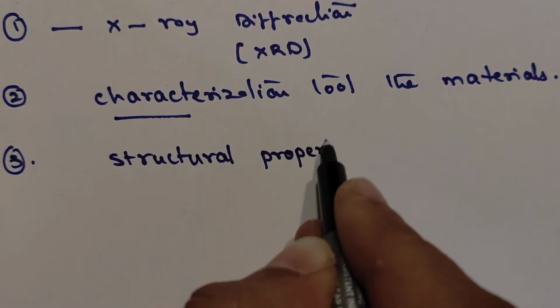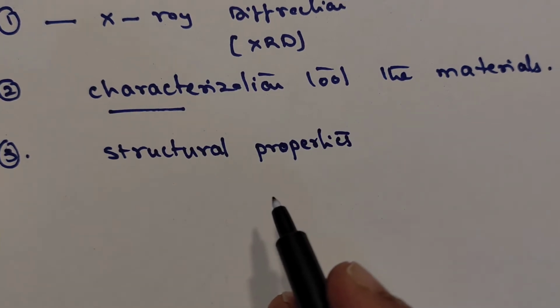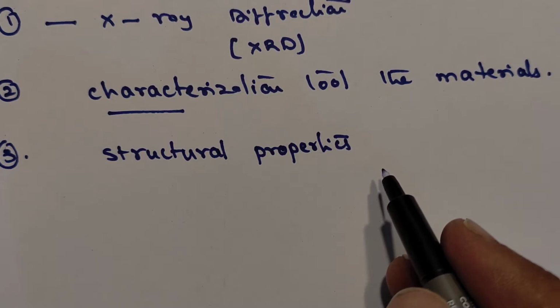That means the structure-related things, whether it is cubic, hexagonal or tetragonal, all this information can be given related to the particular material. How the atoms are distributed, that part we can also discuss by using the X-ray diffraction technique.